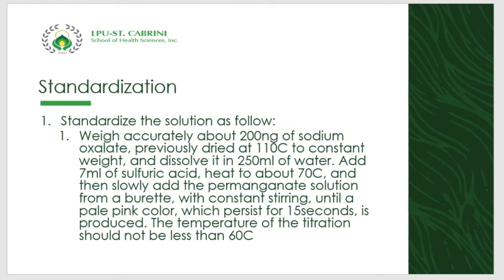Okay? So, when permanganate solutions are diluted to an exact normality, distilled water free from permanganate-reducible matter should be used to avoid the introduction of organic matter. Okay? So, potassium permanganate solution prepared as directed will retain its value for a long time if it is protected from sunlight. Of course, guys, every time we titrate, our burette is wrapped. Okay, it is wrapped with Manila paper or anything that covers the burette. Everyone knows that when it is a potassium permanganate experiment, the chem lab is covered with newspapers so that no sunlight gets through.